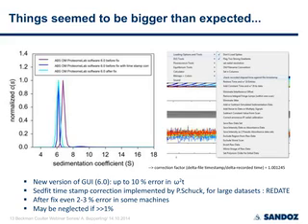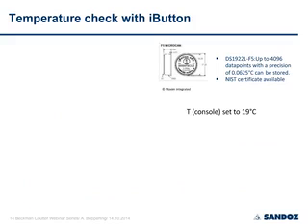And what they also derived, and what I did on my machine, I show you an example here, is to check the rotor temperature and compare it with an external, calibrated thermometer, because the density and much more the viscosity of water around 20 degrees Celsius is very sensitive to temperature. A change of 1 degree Celsius changes the viscosity by about 4%, so it's quite a lot.